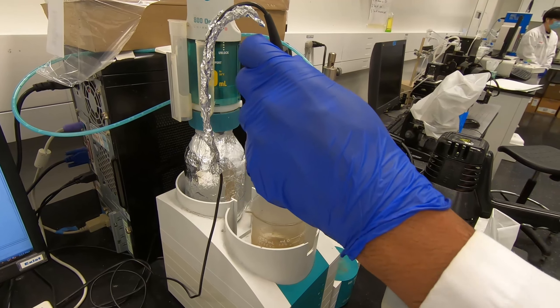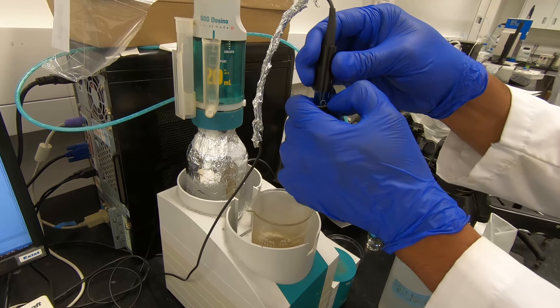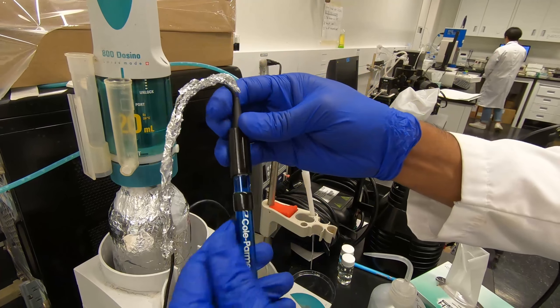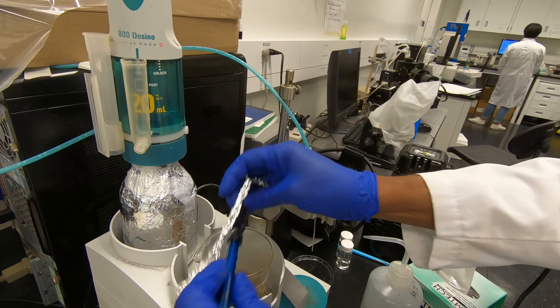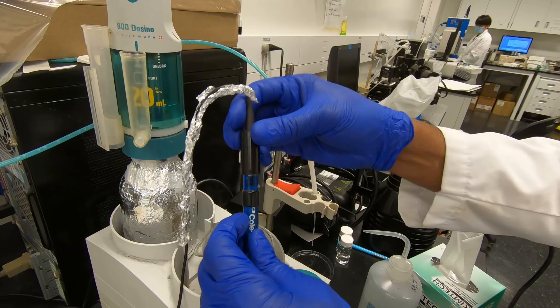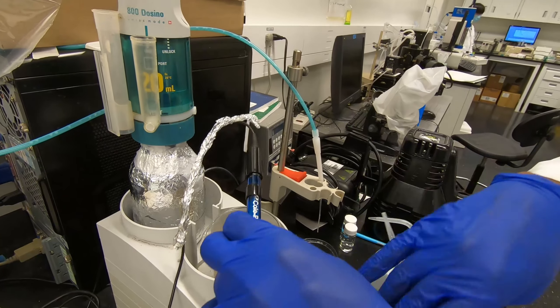They recommend replacing the electrode solution every time when putting in a new sample. So we should replace it this time. We may be using this solution too.